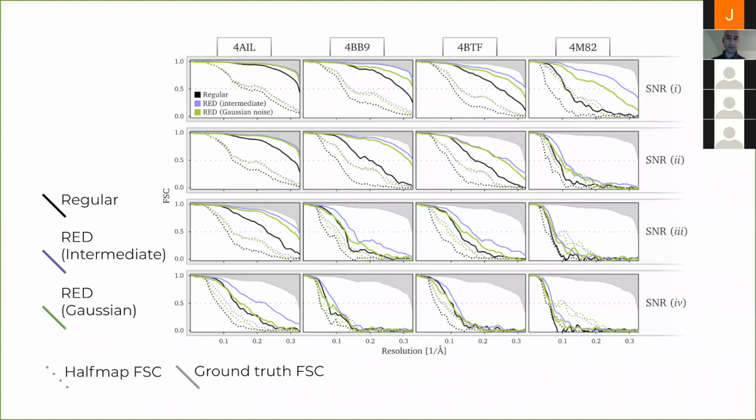You can train neural networks in Fourier space, of course, but you can't then use convolutional neural networks, because you don't have local correlation between your pixels in Fourier space in the same way you do in real space. And in cryo-EM, you do your reconstructions in Fourier space, but in the end you have a full description in real space as well.